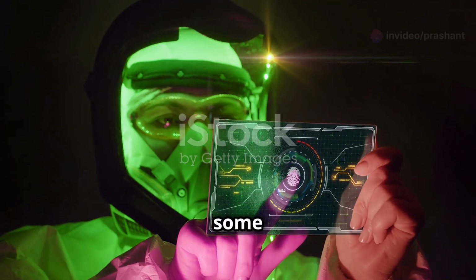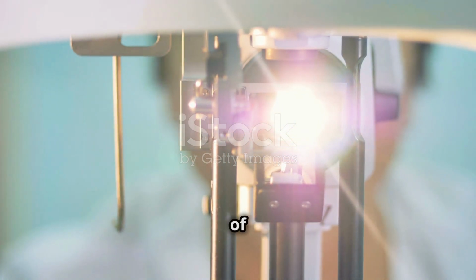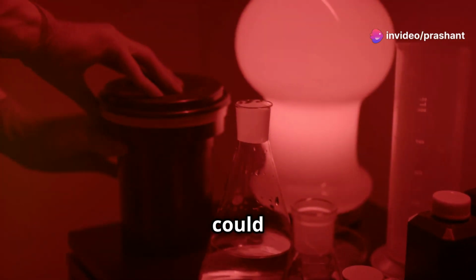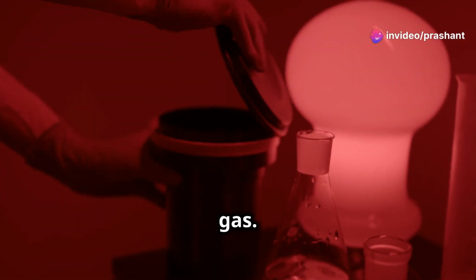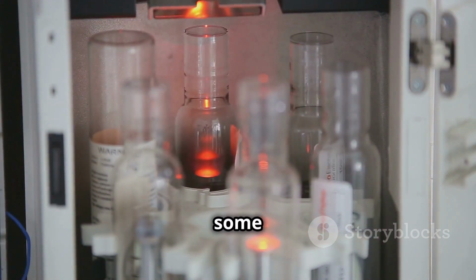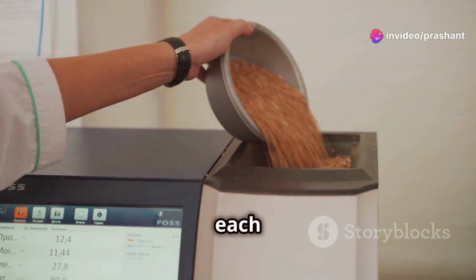Now let's shine some light on how IR spectroscopy actually works. First, we need a source of infrared light. This light is then passed through our sample, which could be a solid, liquid, or even a gas. As the infrared light interacts with the molecules in our sample, some of the light gets absorbed while the rest passes through. The instrument then measures how much light was absorbed at each wavelength.